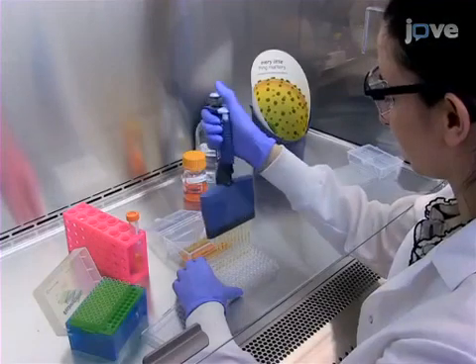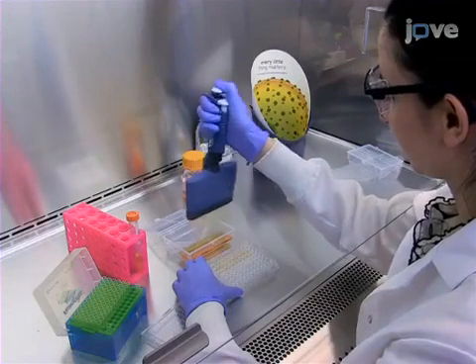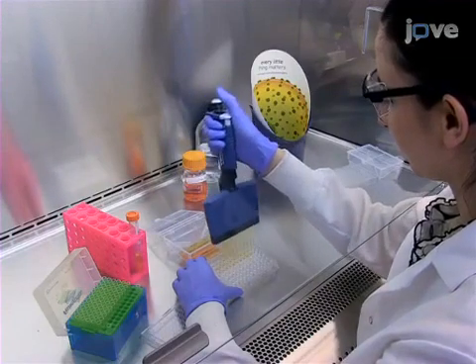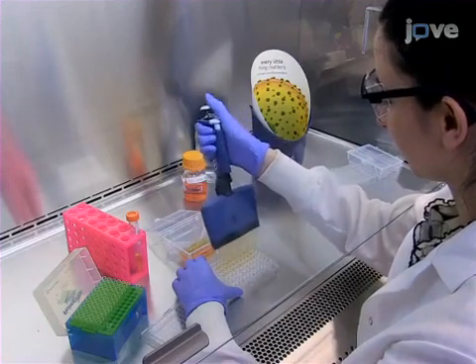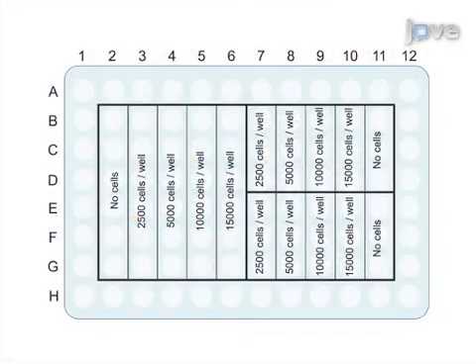To begin, harvest and replate cells in 100 or 200 microliters of media at varying cell densities in a 96-well plate as described in the accompanying protocol. Fill the surrounding wells with 200 microliters of sterile water to reduce edge evaporation effects.